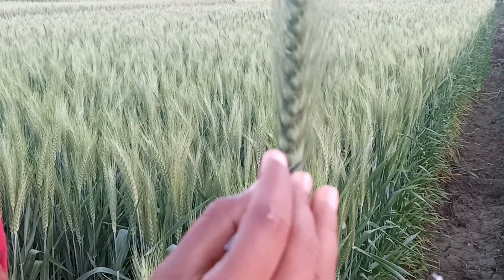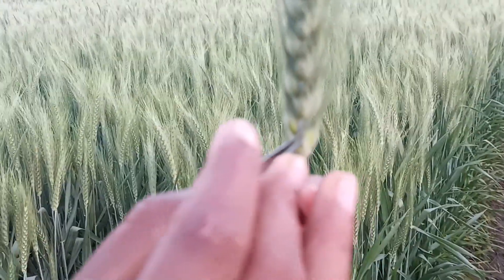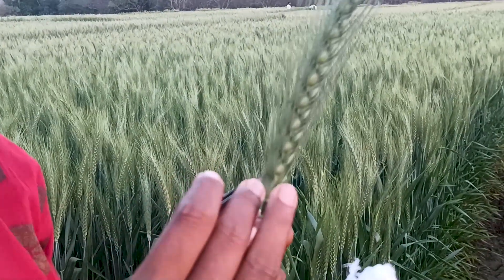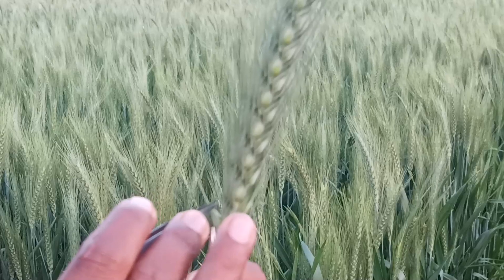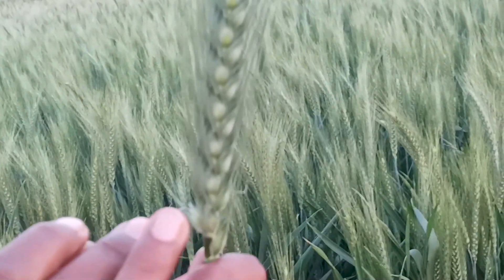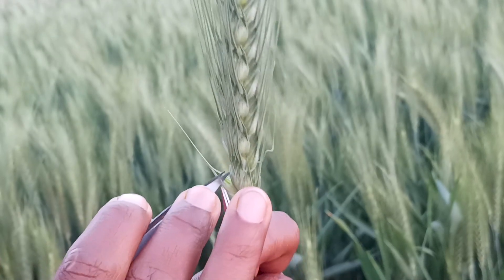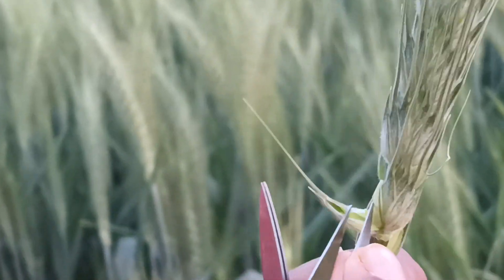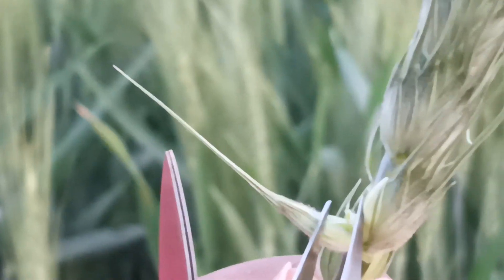The awn is the protruding part of the lemma, and inside, the portion that is smaller than the lemma is the palea. In between the lemma and the palea you can see the anthers. There are three anthers and one feathery bifid stigma.